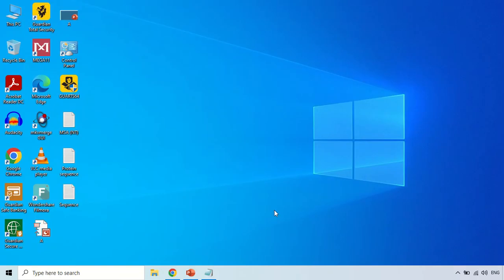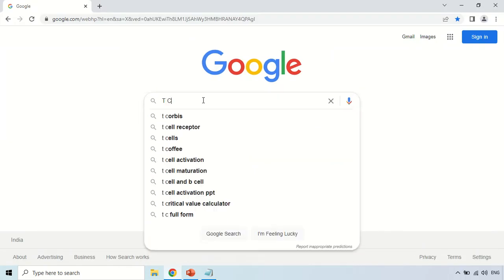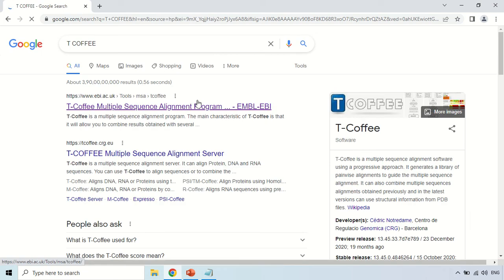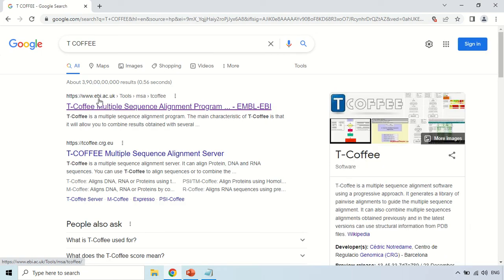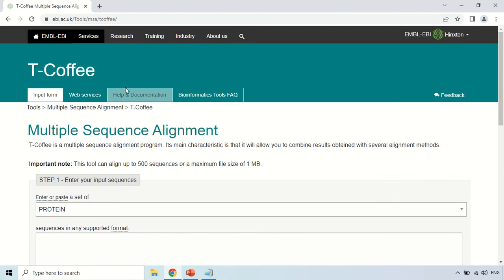In order to perform multiple sequence alignment, just open your browser and search for T-Coffee. As you search, the first website that comes up is www.ebi.ac.uk. This is the main website because this tool belongs to EBI, the European Bioinformatics Institute. Just click on the first website. Now this is the home page of the T-Coffee tool.